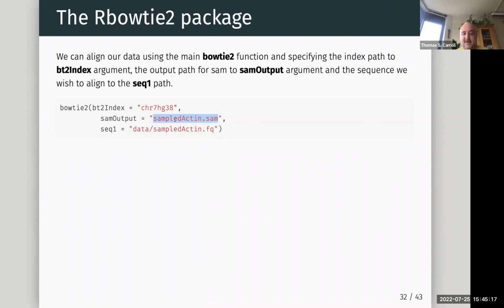What's most annoying about Bowtie 2 is that by unzipping the fastq and by making a SAM file, potentially you're creating two very big files here. Indexing it, making a BAM is much smaller than a SAM, and a fastq which is zipped is much smaller than a fastq. So maybe just transiently, you will need to create these two big files. Perhaps you would delete this once you've unzipped it so you can just keep the zipped version.